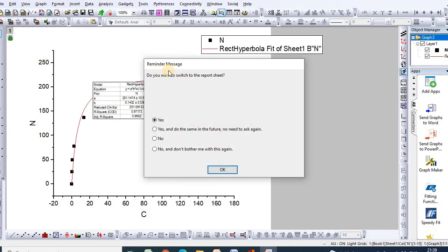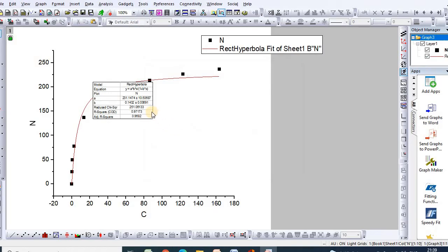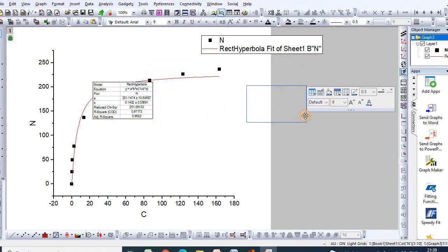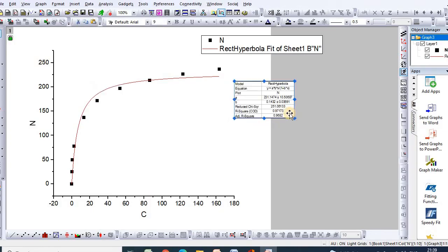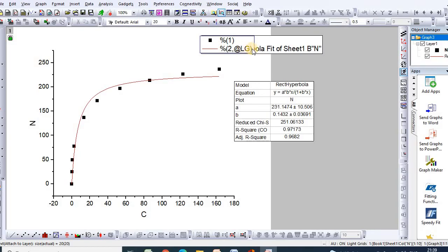A reminder message will appear asking: do you want to switch to the report sheet? Click Yes and the report sheet will appear. If you click No, you can continue. Here are your Langmuir isotherm fitting parameters — you can rename it as Langmuir.